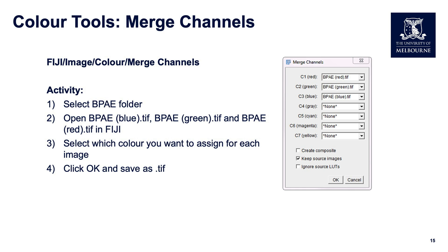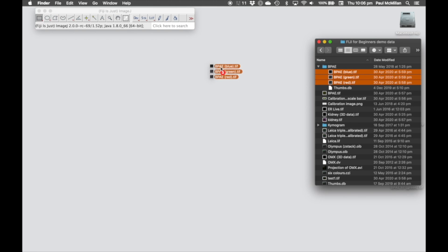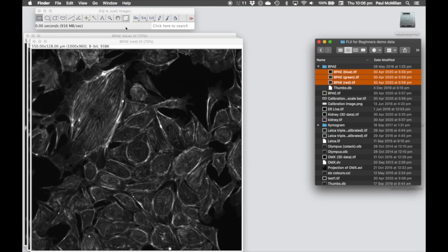We're going to take individual channels and merge them into an RGB image. In this case we're going to open up the BPAe folder and highlight all three BPAe blue, green and TIFF images to use in this activity. We can drag and drop these all at the same time.